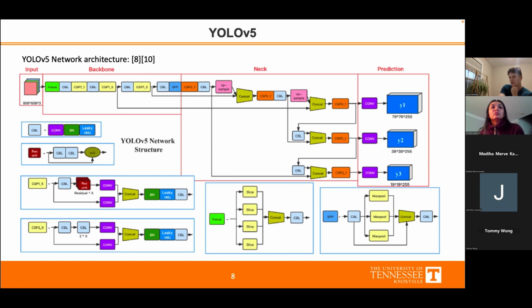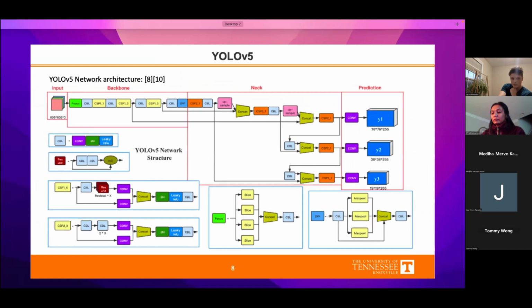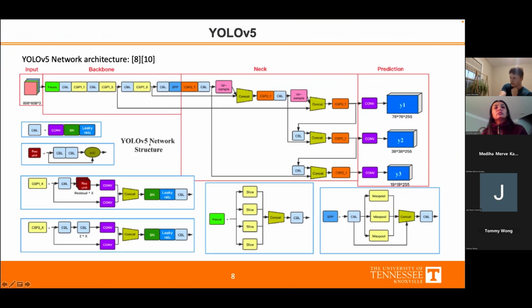Yes, so I believe the initial layers, or the backbone, are actually to identify where the object is with respect to the background. And then the neck, I believe, is more for passing through these conditional probabilities for what class of image it would be. I would have to read a bit more because it wasn't totally clear, because the architecture actually varies slightly between each different YOLO v5 build, N, S, M, L, X. But in general, I believe it's trying to focus in on details from the whole image broadly to identify where everything is, and then to identify the actual bounds of where each object is and the class of the object within the bounding box.